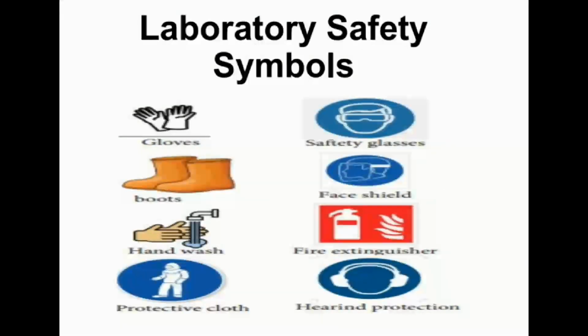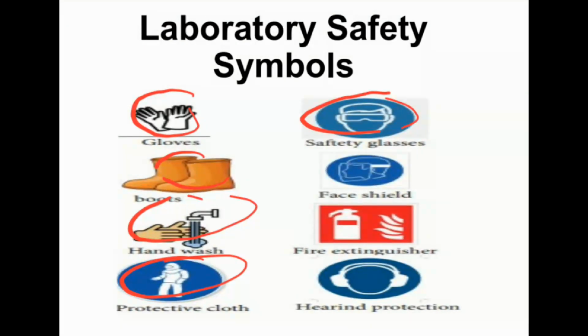Laboratory safety symbols: gloves, here you have them; boots; hand wash; protective clothes; safety glasses; face shield, ስለዚህ ፊታችሁን ለመሸፈን ማለት ነው. And this is a symbol for fire extinguisher, የእሳት ማጥፊያ ማለት ነው, and this is for hearing protection. ስለዚህ እነዚህ laboratory safety symbols መለየት አለባችሁ ማለት ነው.